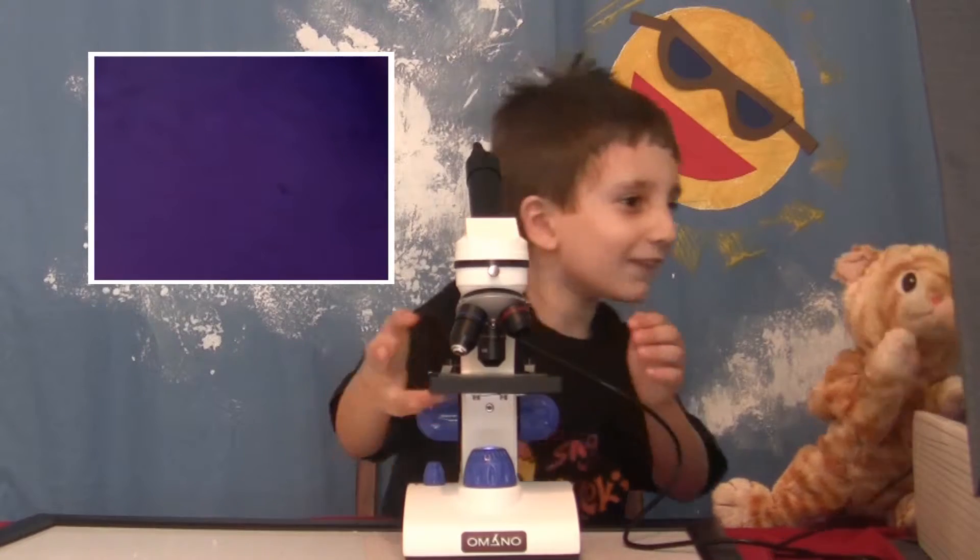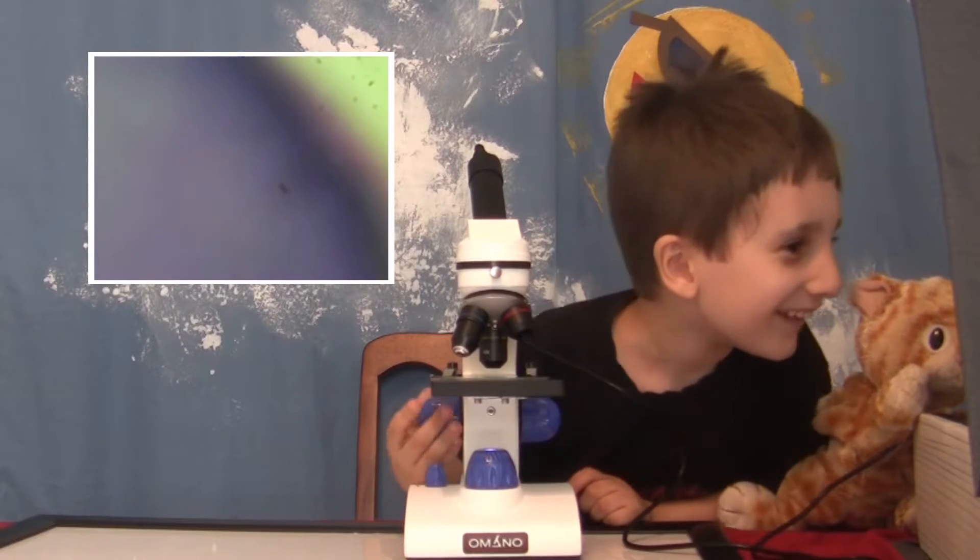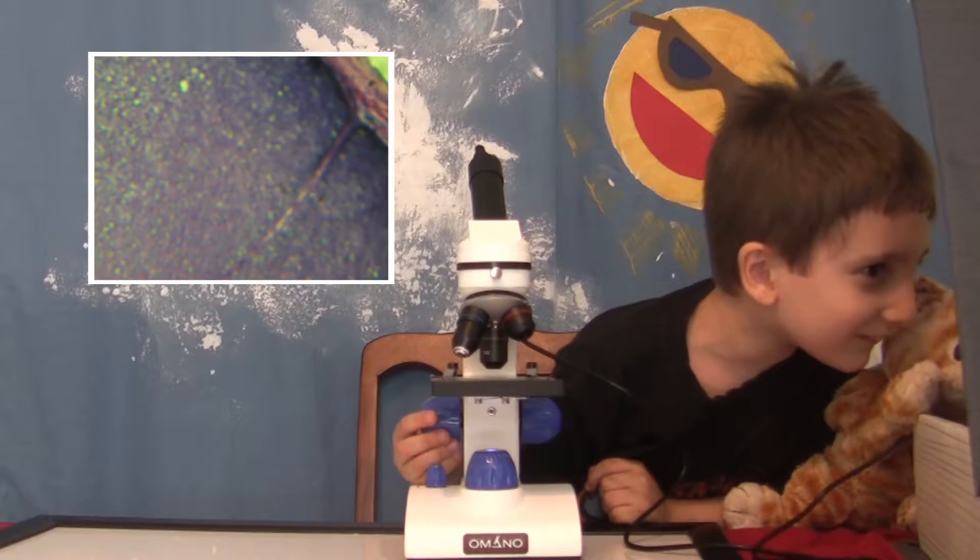Wow! There it is! Oh! That is so purple! What? What? I found some tiny dots! Okay, try to... Oh! And now focused and unfocused again. There it is. Oh. That's pretty cool. Wow! Pretty! I like it. So, that's what a spinal cord looks like.